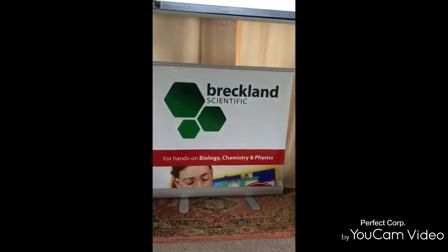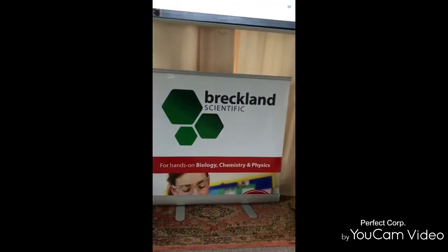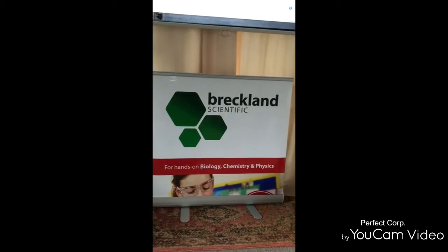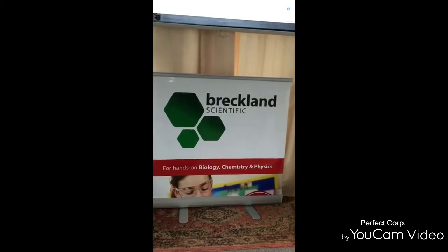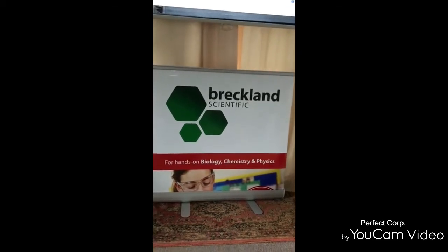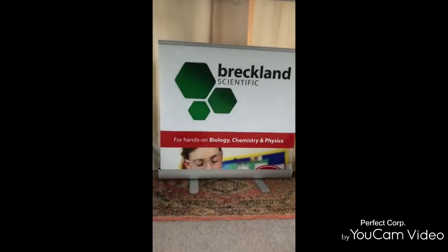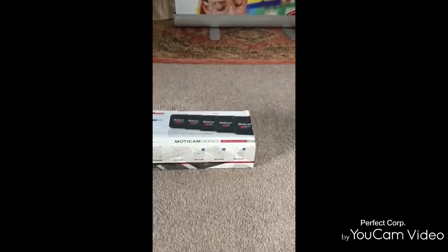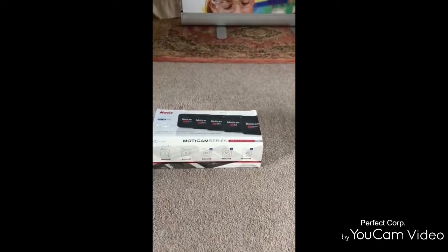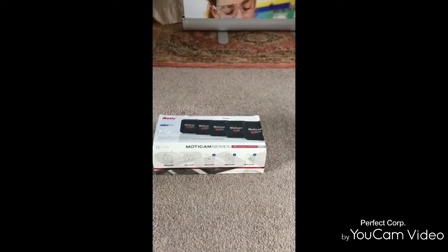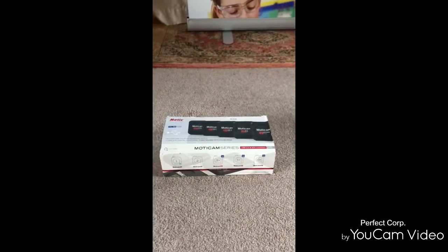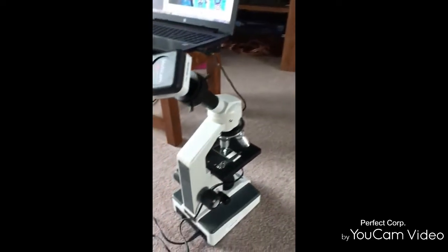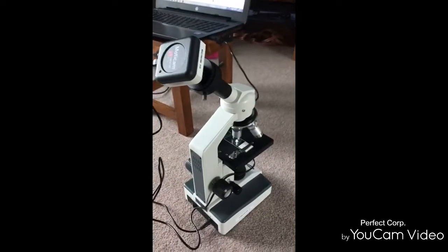Hello virtual customers. This is a virtual Breckland Rep with a demonstration of the Moticam 1, which can transform any microscope that you have into a digital one.